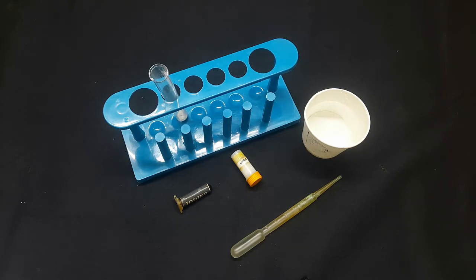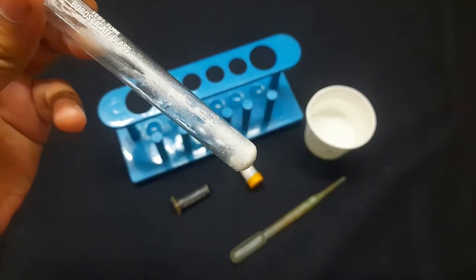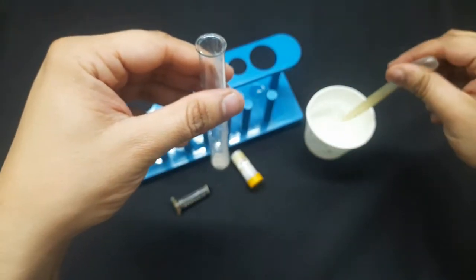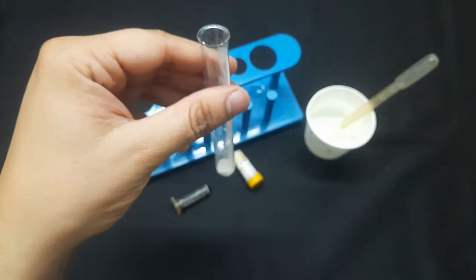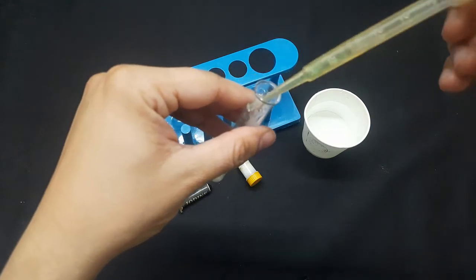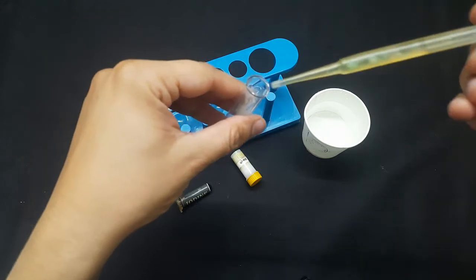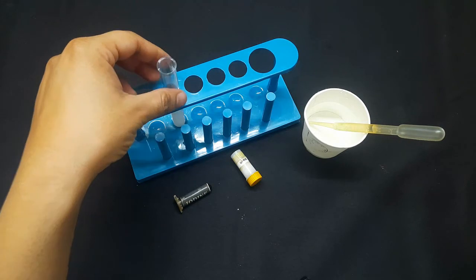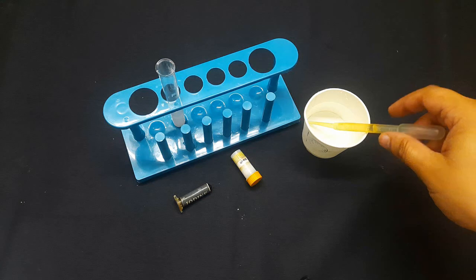So the next step is that as the starch is in powder form, as you can see, we have to make it an aqueous solution. So for that we need water. You can take around 3 ml of water with the help of a dropper, and you can put it in a test tube like this. So in this way we are making the aqueous solution of starch powder.